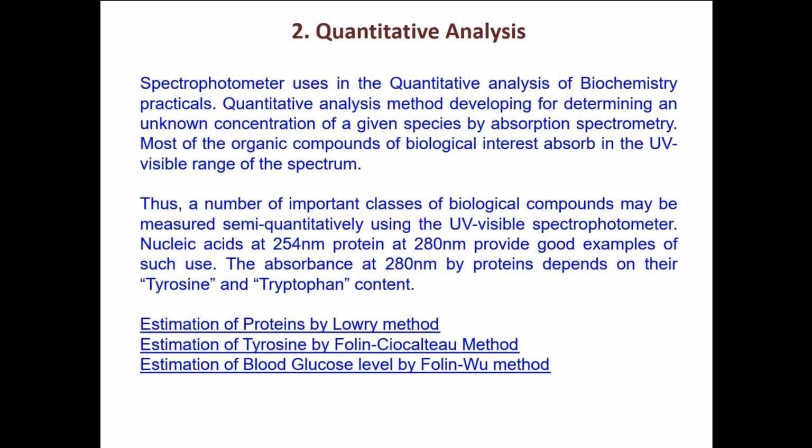So in the enzymatic reaction, you can see that we select either the products or the substrate molecules as a characteristic property at either the UV or visible region. In this lactate dehydrogenase mediated reaction, we select NADH as the characteristic molecule, with characteristic absorption at 340 nanometers.